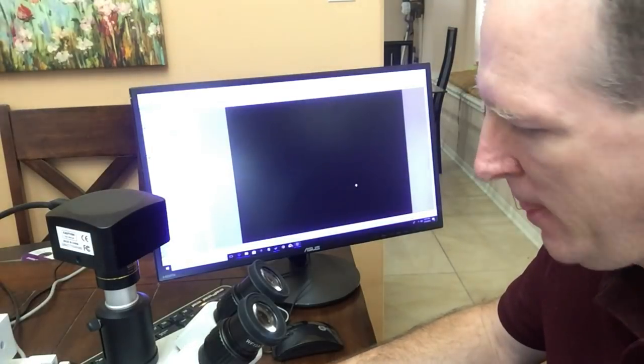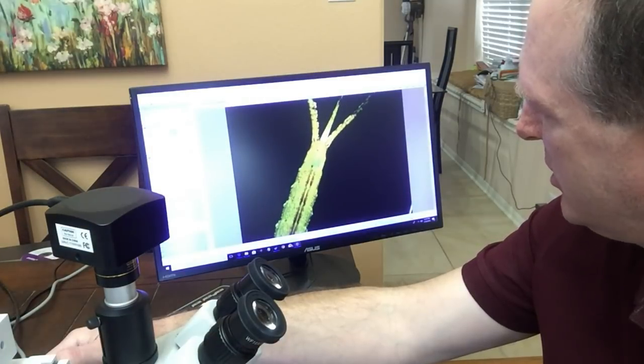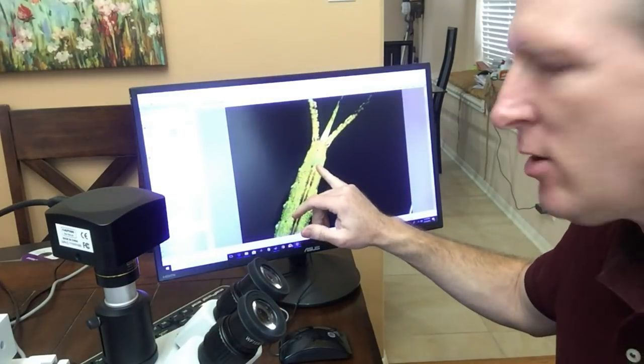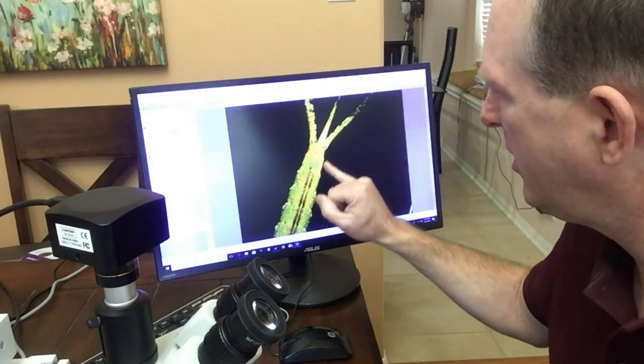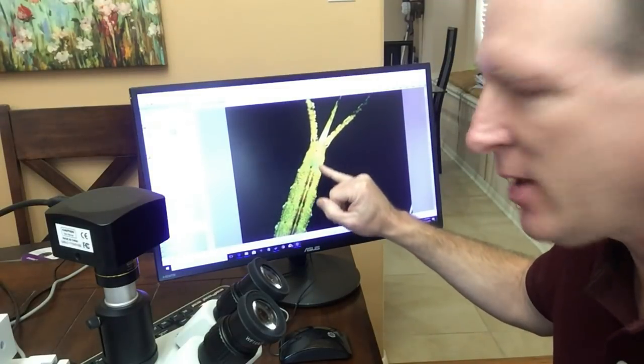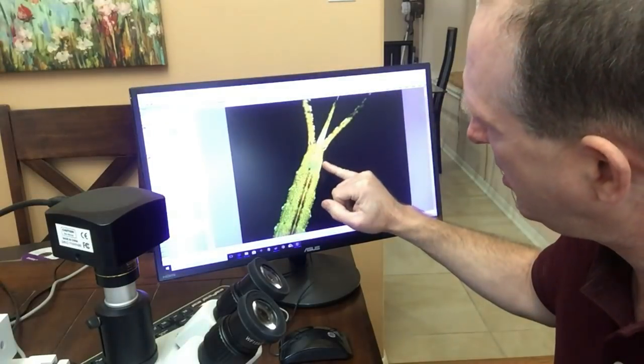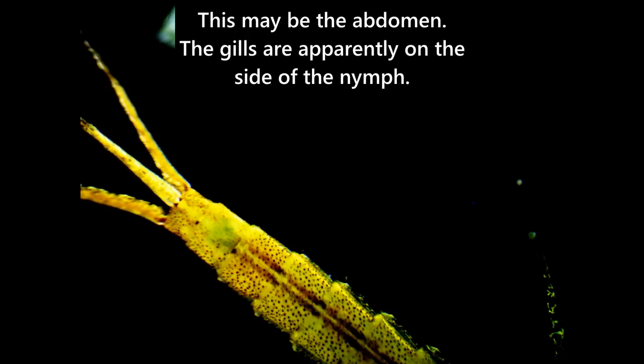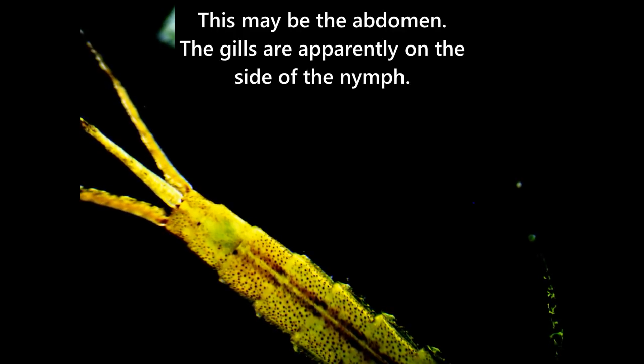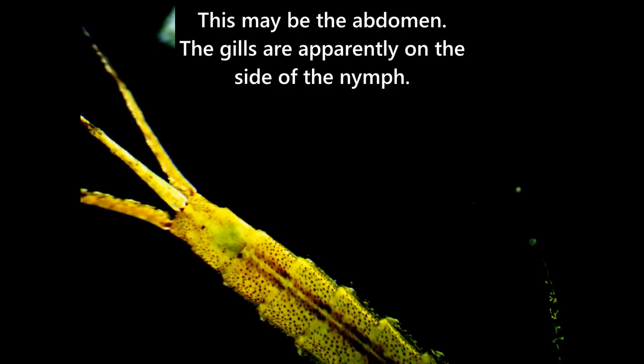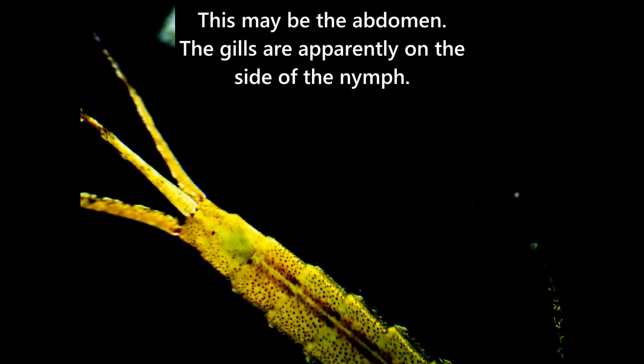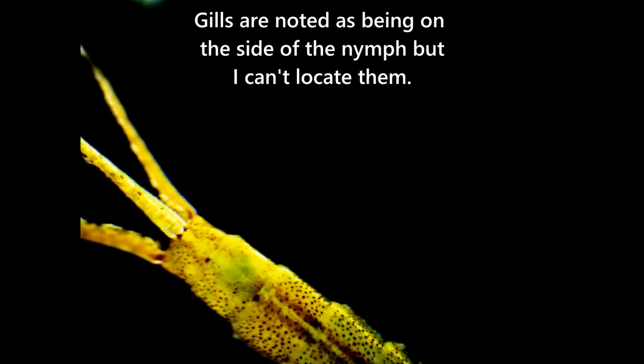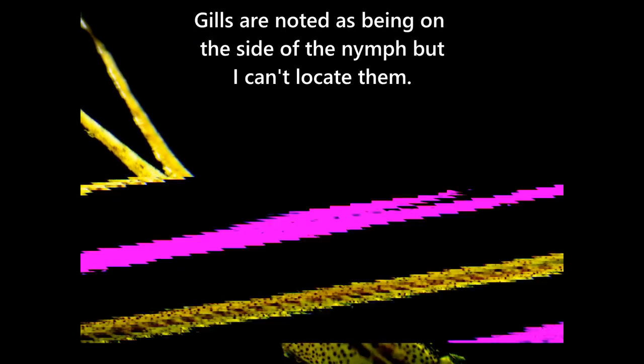And take a look at this. This is right at the back of the tail. This is actually where they breathe, so they have gills here, and I believe it's seven gills. And you can see there, it's actually moving. Very interesting. You can actually see where it's breathing. Look at that. It's on the bottom of their tail, on the inner side, that they actually take in the water to breathe.